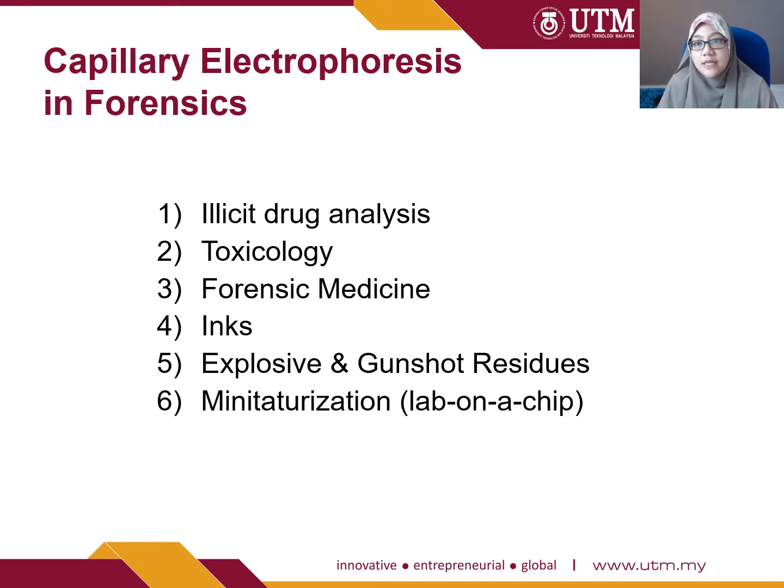First, CE is usually used in illicit drug analysis, whereby in 1980, the separation of drugs in synthesis mixtures like cocaine, methamphetamine, morphine, heroin, etc. can be separated because CE is a very fast separation technique, and it only involves a very small amount of analytes, so that's why it's easy to separate this type of drug.